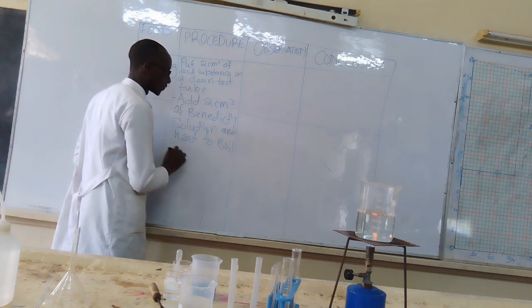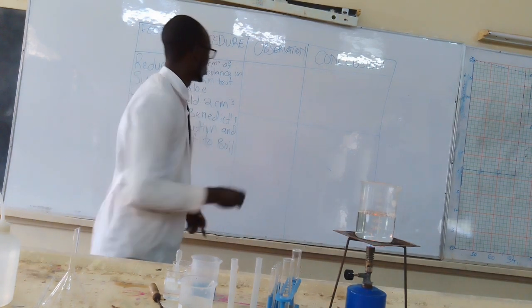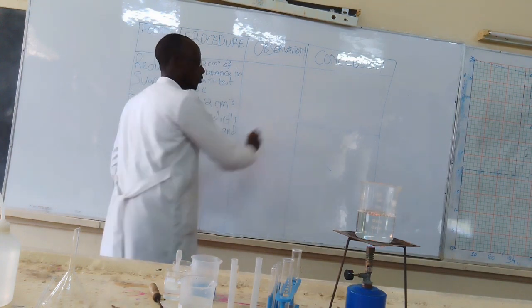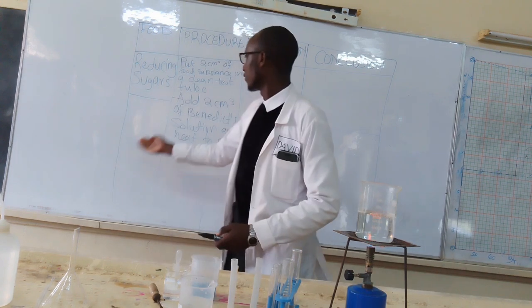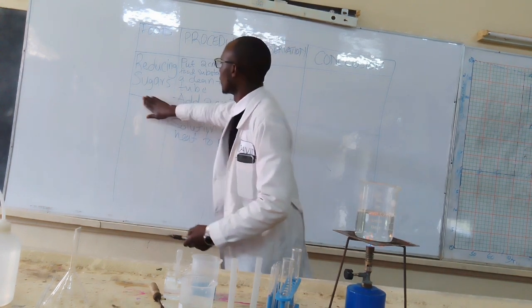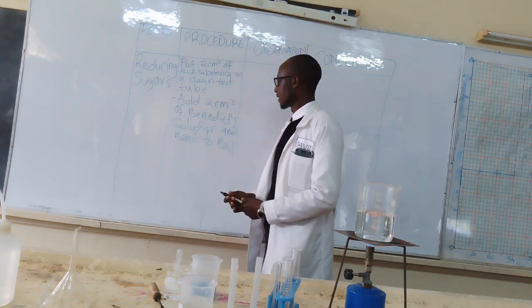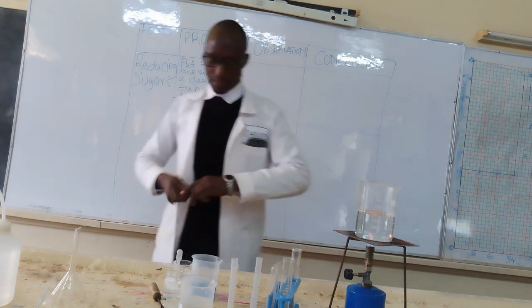That is our procedure. So we are going to do exactly as we've written here.